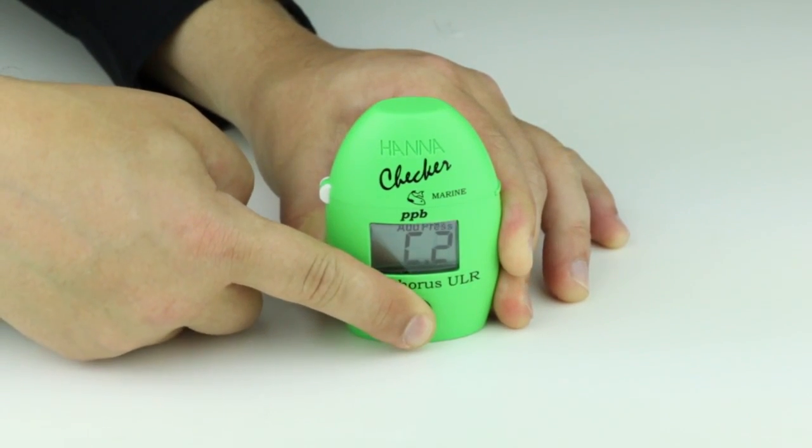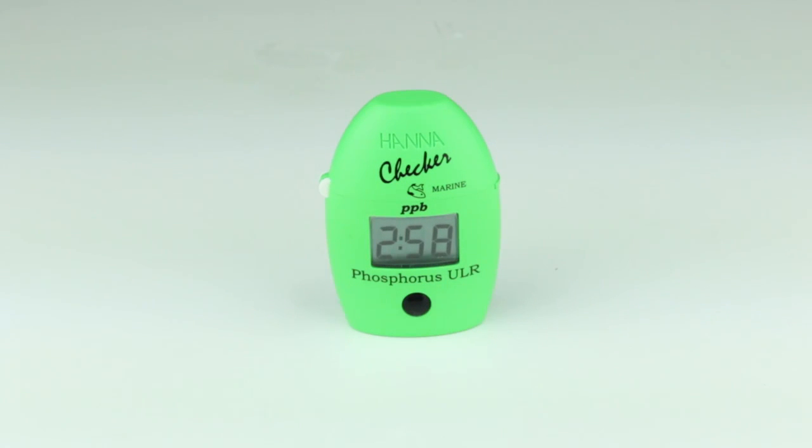Press and hold the button until the timer is displayed on the screen. A three-minute countdown will begin.